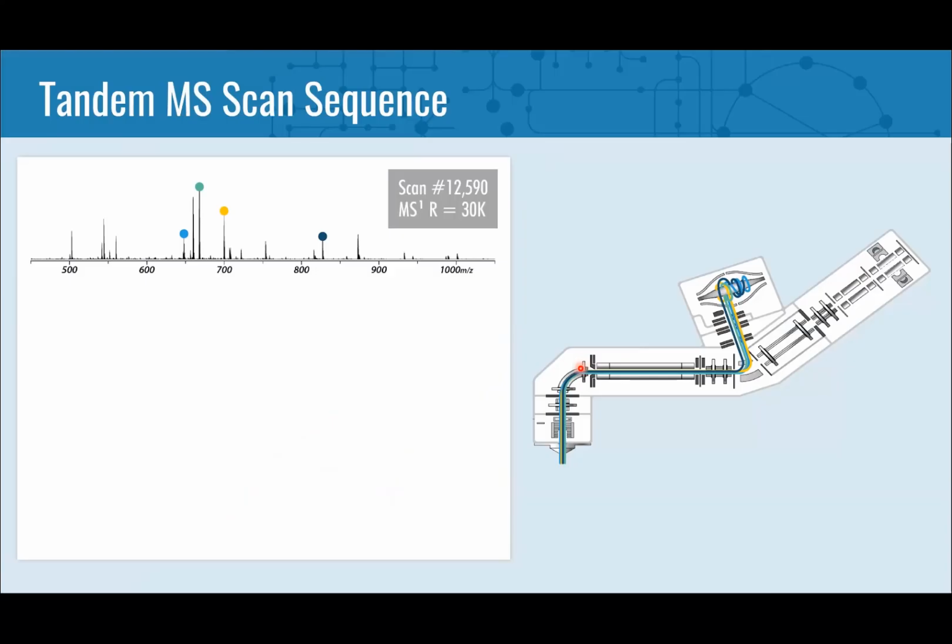figure that shows us the instrument we're using, but let's talk a little bit about the process of looking at and sequencing a subset of these tryptic peptides. So now we've got peptides eluting into the mass spectrometer. These are tryptic peptides. And here I've highlighted 4 of them. And let's say these 4 are being selected for MS-MS.